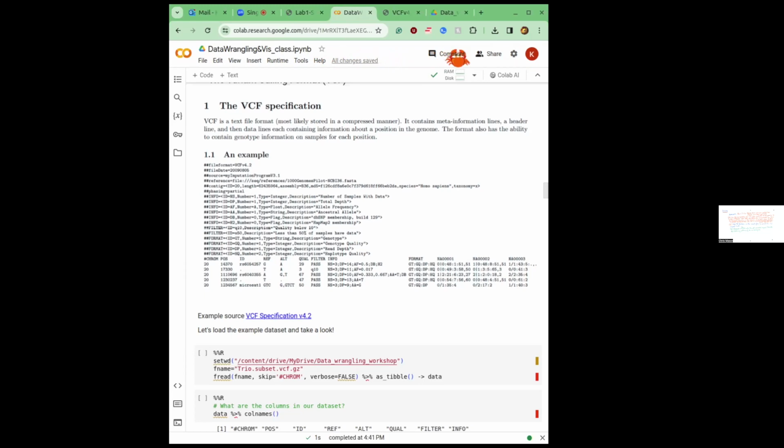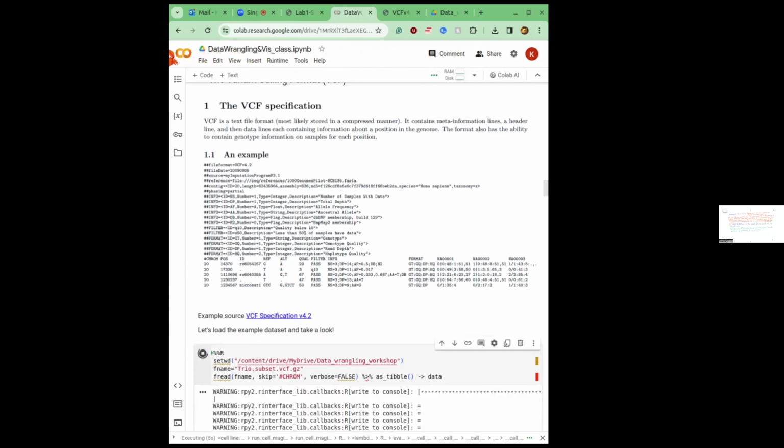In the natural population too, you're going to get these transcriptomic and DNA modifications, as mentioned, that are going to go through the pore and change the signal in a way that the model might not have accounted for. So if you have, for example, an m6A methylated base or an 8-oxo damaged base, and it goes through the nanopore, it might look like a C, it might look like a U, it might look like some other base. Some of the earliest base modification algorithms to detect those bases looked at errors specifically, in the context of calling the base modification. So that if you saw a SNP, it must be because the base is modified, not because there actually exists a SNP at that position.